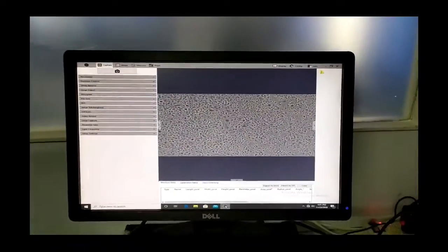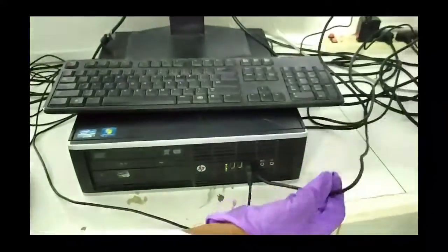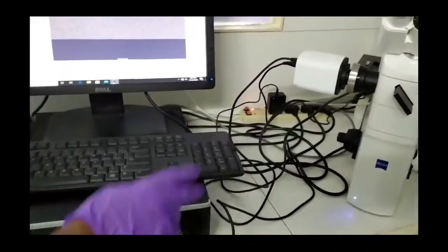Now we are switching on the microscope. The camera view has been shown on the screen. What you can see is 4x magnification of the cell, visible on our computer. This is possible because we have software communicating with our hardware. The software is known as MOSAIC, version 2.0. It communicates with our camera through the USB port. The camera has two connections: one for power supply and one for data transfer via USB cable.